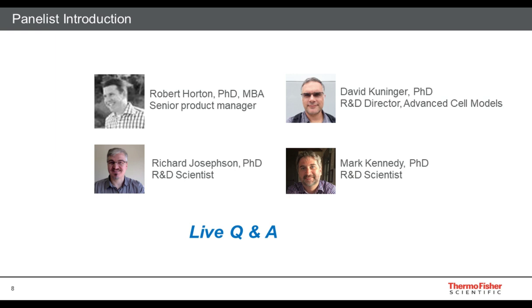The tip that I would give, based on my experience, is plan. These protocols tend to be pretty long. For a lot of people, if you've been working in a lab for a while with what today we would call more traditional models, and you're trying to make the switch to a 3D model, there is a little bit of a learning curve on being able to adopt these culture systems. It's a different way of looking at cells. The analysis is more challenging.